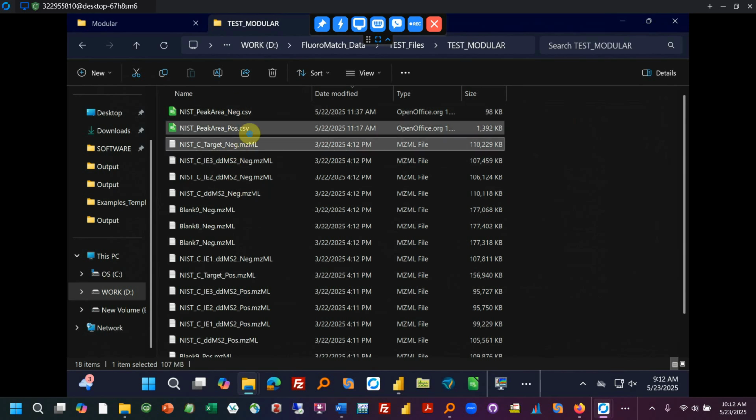Then you have your mzML files that you've converted using MS-Convert, or for Agilent you'd use Qual, or for Shimadzu you'd use their vendor file. But however you best can get mzML files, which we've discussed previously in the previous tutorial on file conversion and naming conventions, you want to get those mzMLs, and you want the naming conventions to be correct.